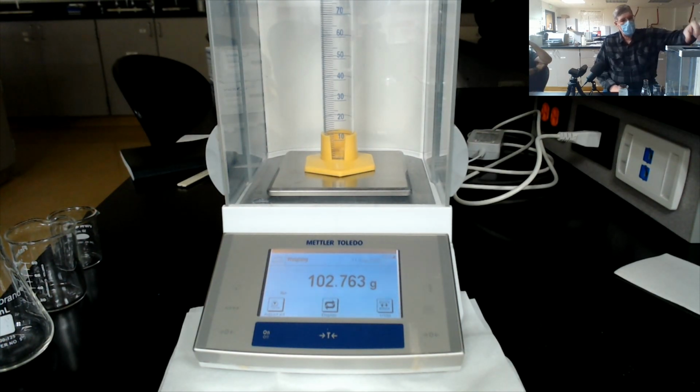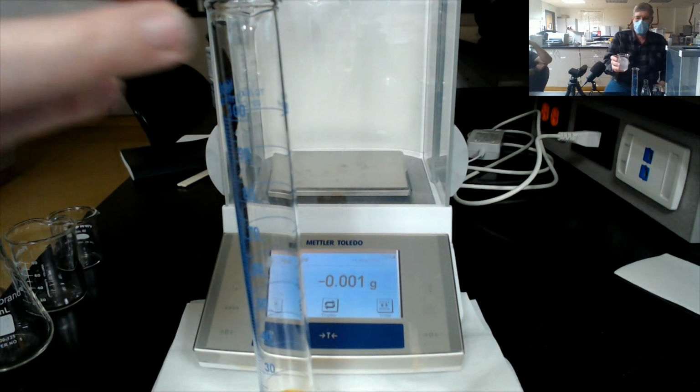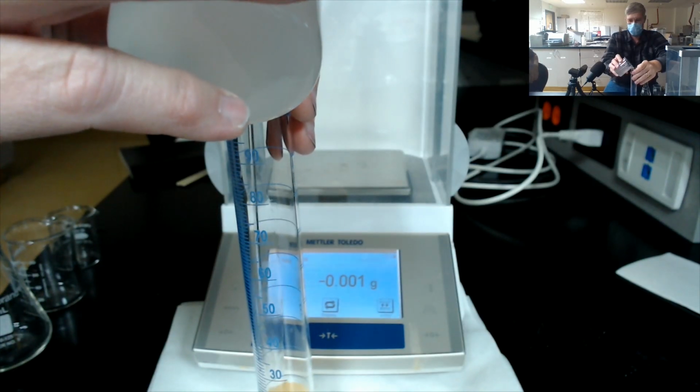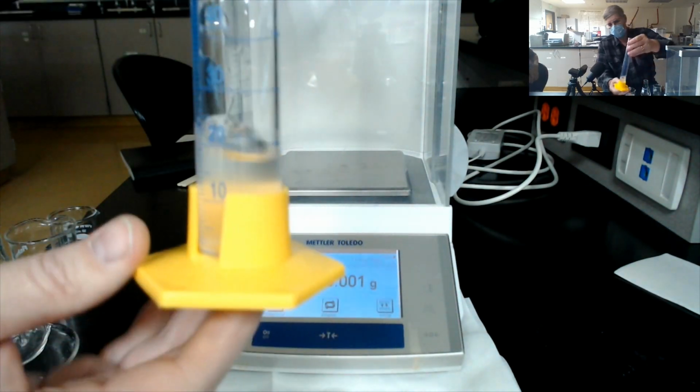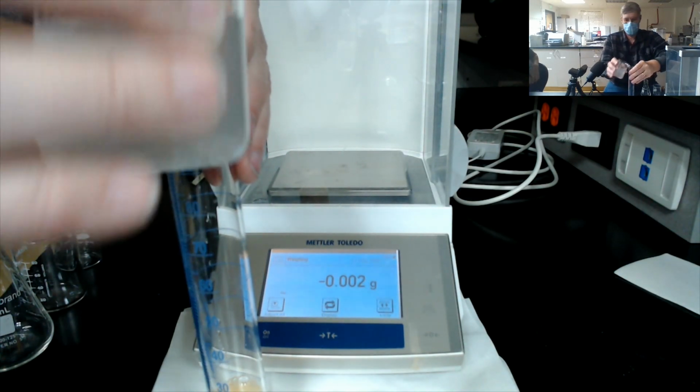All right, now that we have the mass of the empty cylinder, we're going to add an amount of the unknown liquid and record its volume directly.